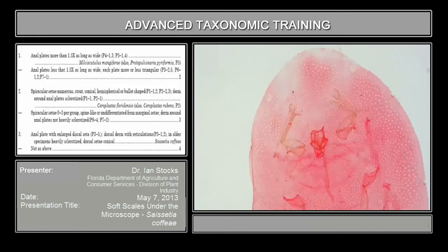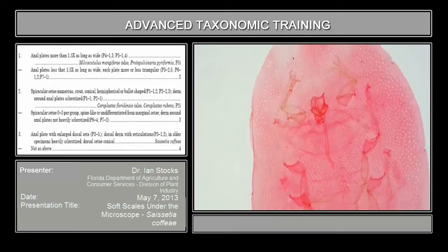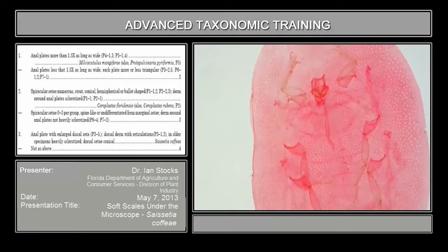This is an example of a genus where the presence or absence of the tibiotarsal sclerosis happens at the species level. So some species within this genus have it, and some species don't. Of course, we've got the base of the leg here, the coxa, and just to the side of it is the spiracle, the fairly indistinct spiracular furrow.